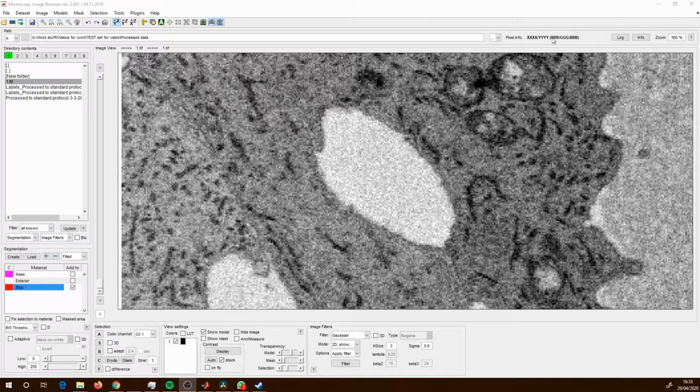But in this case, we only have one channel because it's a grayscale image. So that number, say here, is 200, 243, 193, 206, 195. So we're looking at somewhere between 190 and 240 potentially, or maybe even higher, 250.